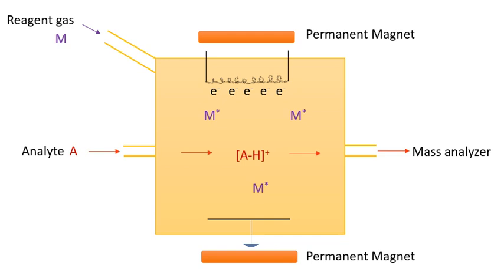to achieve ionization. Negative chemical ionization (NCI), charge exchange chemical ionization and atmospheric pressure chemical ionization (APCI) are some of the common variations of this technique. CI has several important applications in identification, structure elucidation and quantitation of organic compounds. Besides the applications in analytical chemistry, the usefulness of chemical ionization extends toward biochemical, biological and medicinal fields as well.